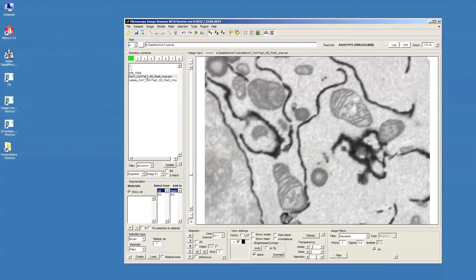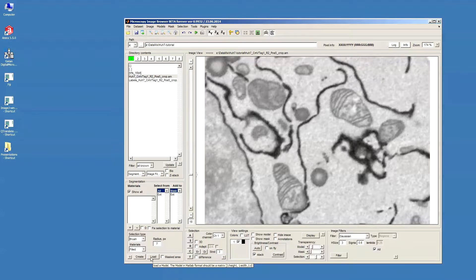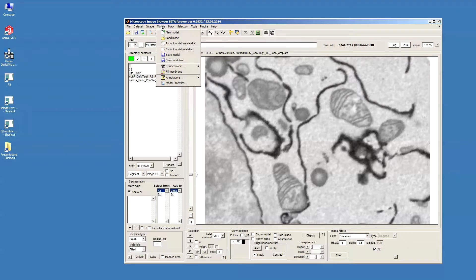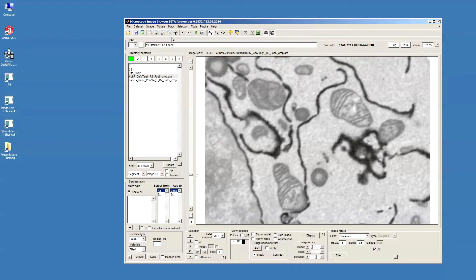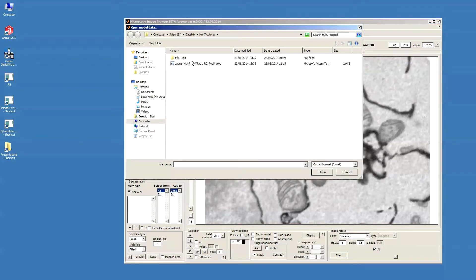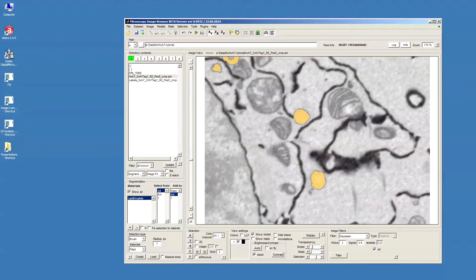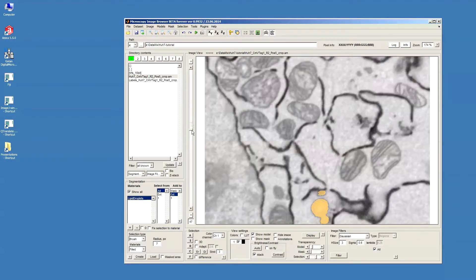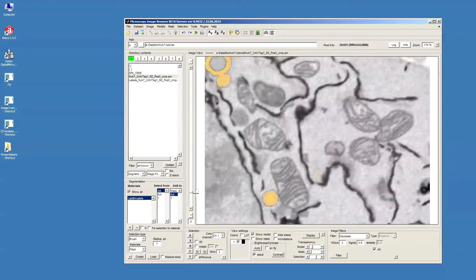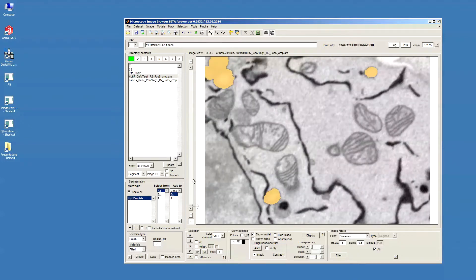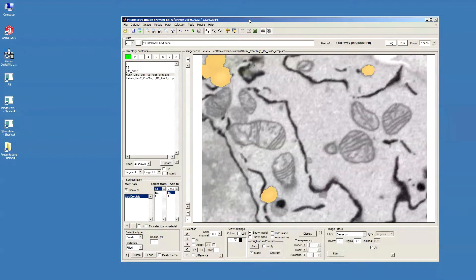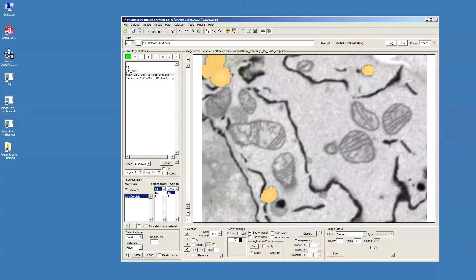Next to the dataset, we have a model, so we can open it by pressing the Load button in the bottom of the segmentation panel or from the main Load model. Now, you can see that we opened the dataset, and we have the model of these lipid droplets that we segmented during the previous part of this tutorial.